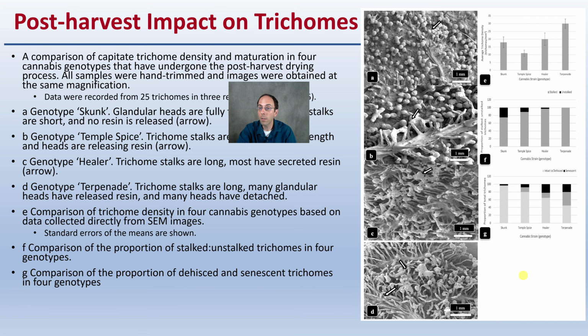So this just speaks to knowing your genotype, knowing what variety you're growing, maybe growing it multiple times to get an appreciation for its characteristics, and making that selection can be very important. Because as we can see here, there's great variability, and one's not necessarily better than the other. Just understanding your own variety, understanding what it produces, to hopefully maximize and optimize your yield in your cannabis plants.